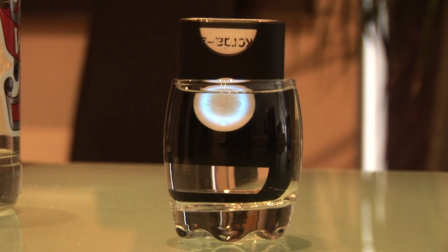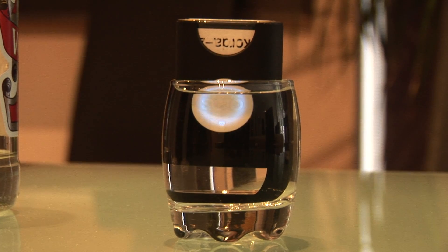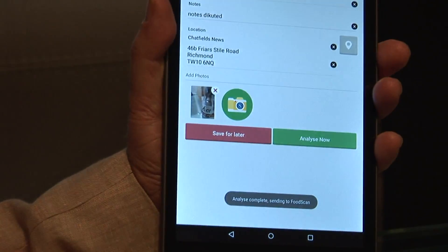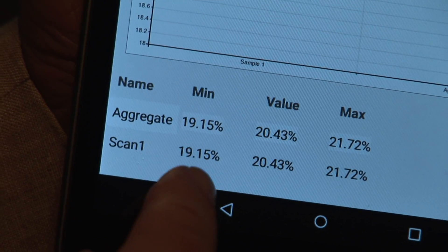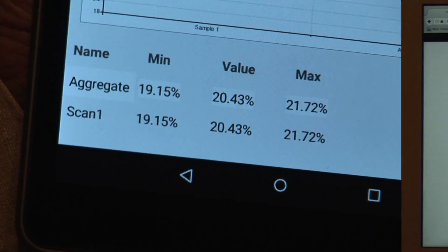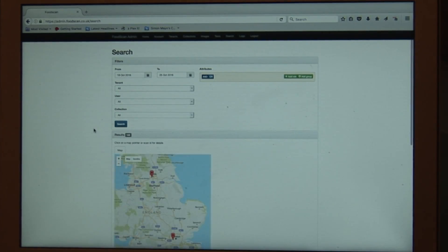If it all goes well, it should be approximately 50% of the previous value. When the analysis is complete, you can see that it's between 19.15% and 21.72% alcohol.